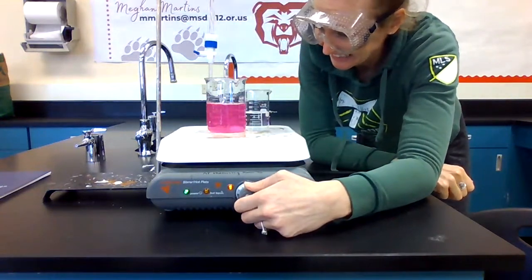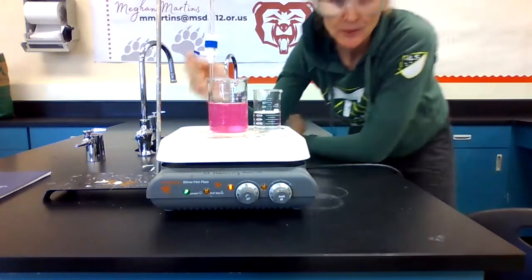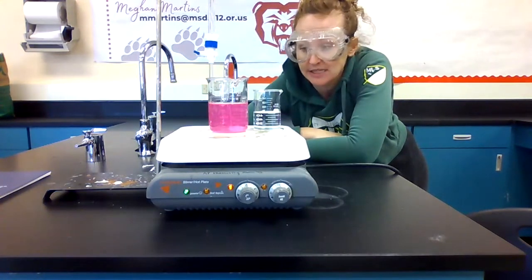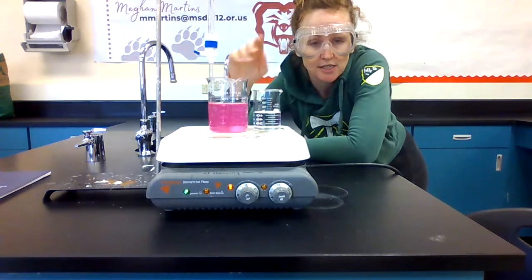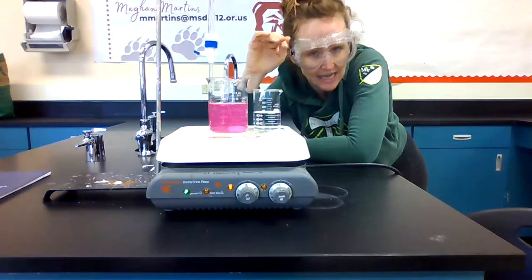Okay, so you see I've hit it. I am obviously pink here. And I would call that an overshoot. I have overshot the end point here. I've added way too much base. And that was a matter of a pour and an end. But at least now I have a ballpark of how much base it's going to take me. And then I can rerun this titration, and at the end I can go drop by drop by drop. And hopefully your ending solution is going to be more of a light pink. As soon as it's not clear, when it's any shade of pink at all, it is officially done.